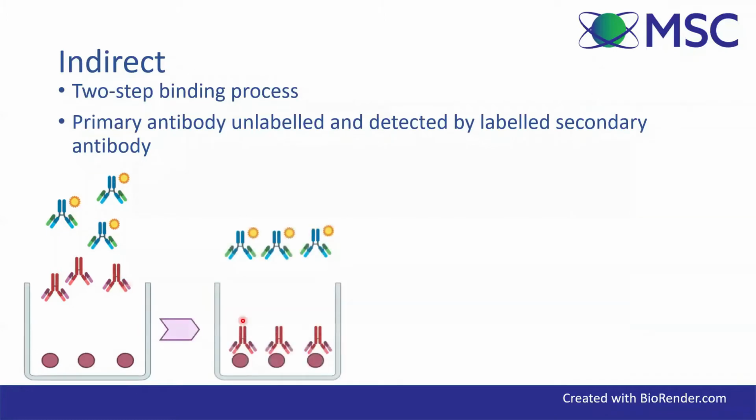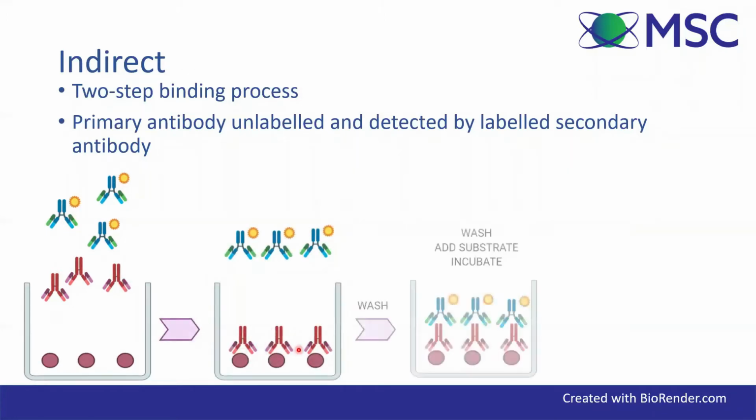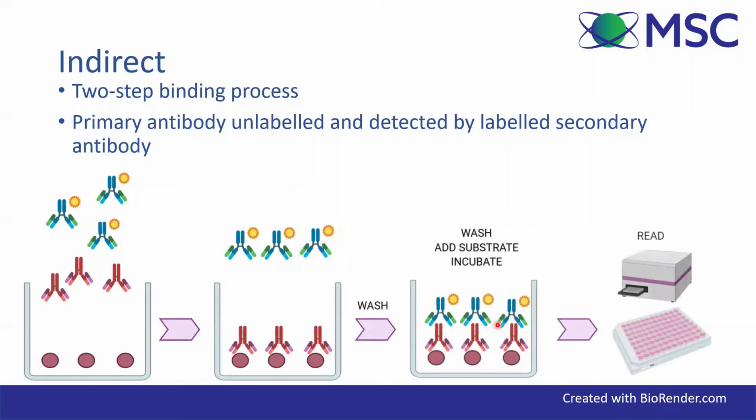well. You add your primary antibody, which will obviously recognize the antigen and bind to it. You add your secondary antibody, and then wash and add substrate and incubate, and then you read.